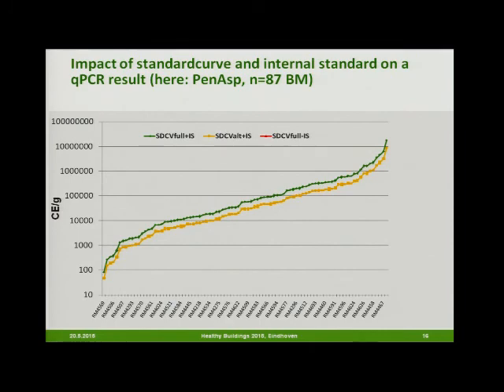If you choose to be a bit more lazy and just do a standard curve with one or the other strain, you might end up either quite clearly below or quite clearly above, depending on which strain you pick. So it really matters to say how you did the standard curve.